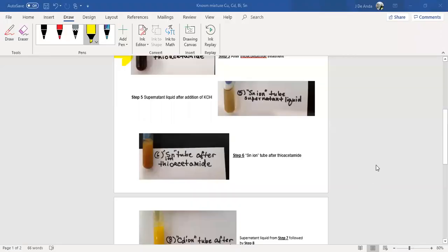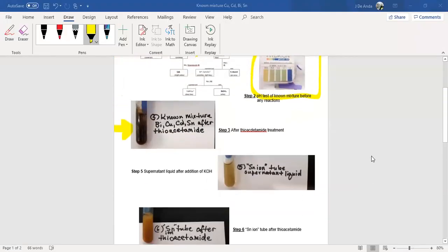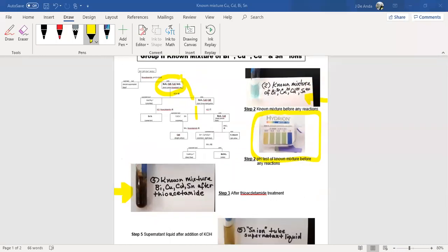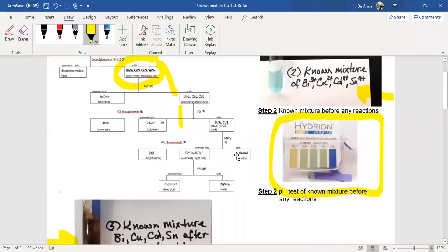Okay, here we go. So here we are. Remember, in our process, we were over here, right? We had our precipitate with the 3 cations in the form of sulfides. We added HCl, so we redissolved the cadmium, and now we reprecipitated.